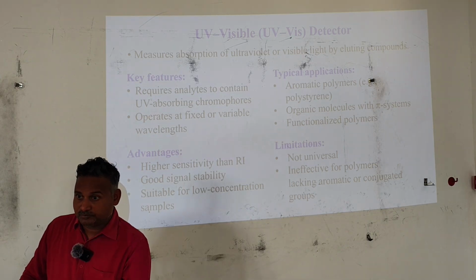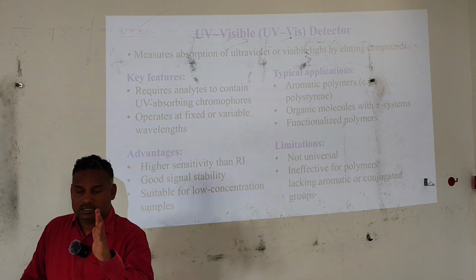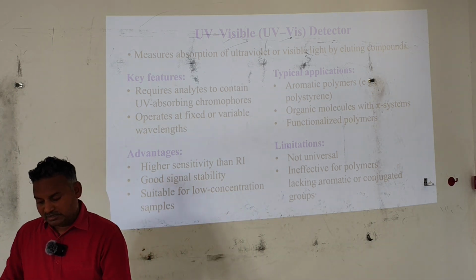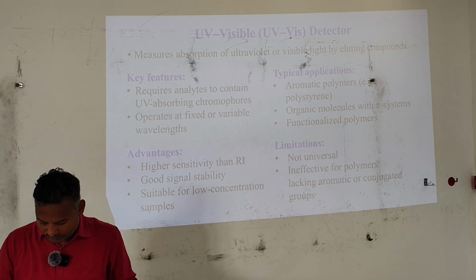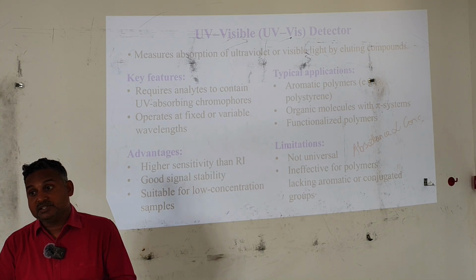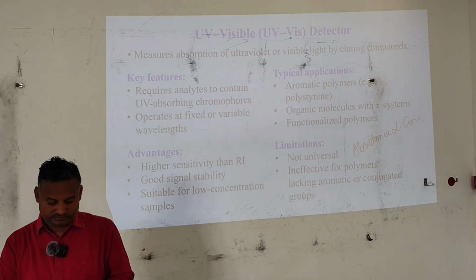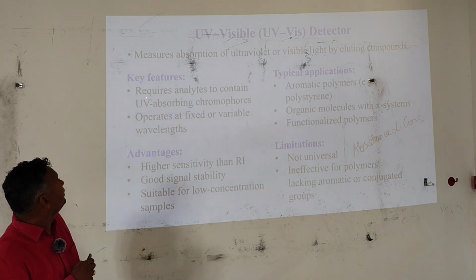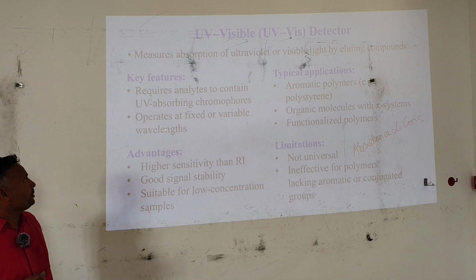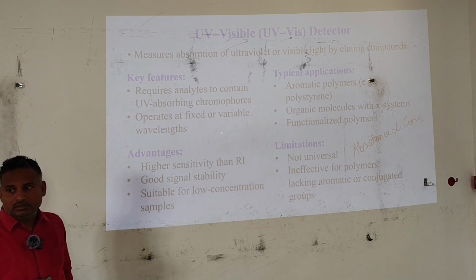I think you have an idea. It will measure the concentration based on what? Based on the absorbance. In this case, the absorbance is directly proportional to concentration. Key features: it requires analytes to contain UV absorbing chromophores, and operates at fixed or variable wavelengths.